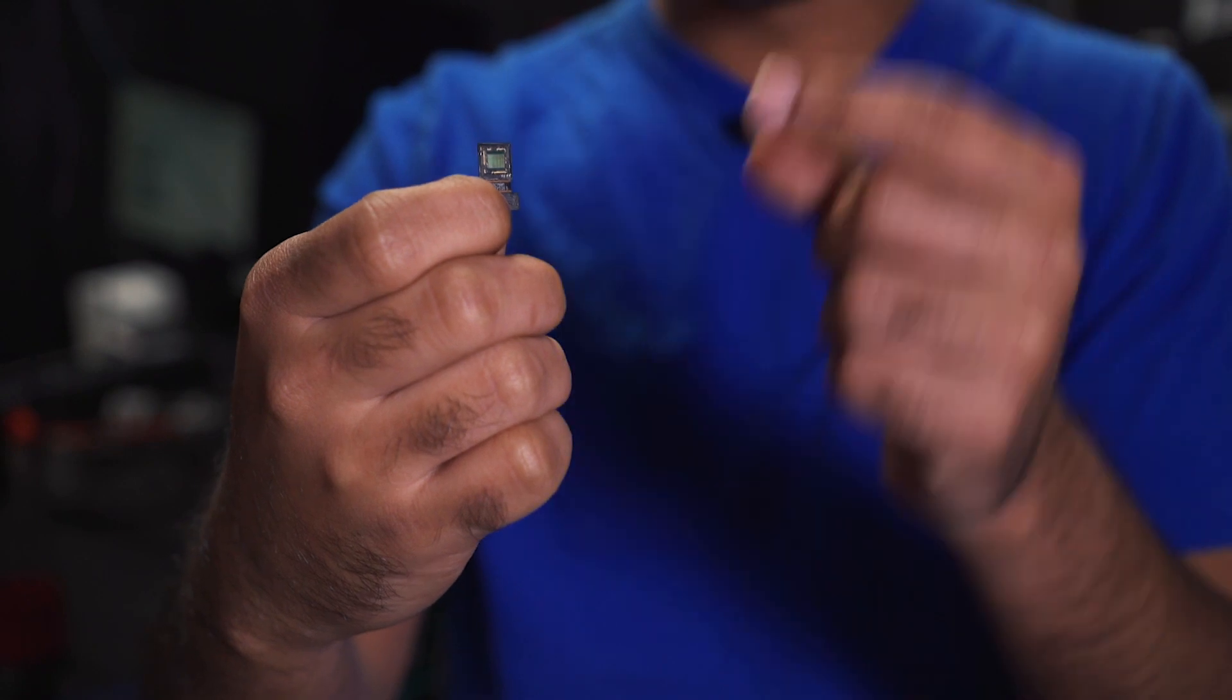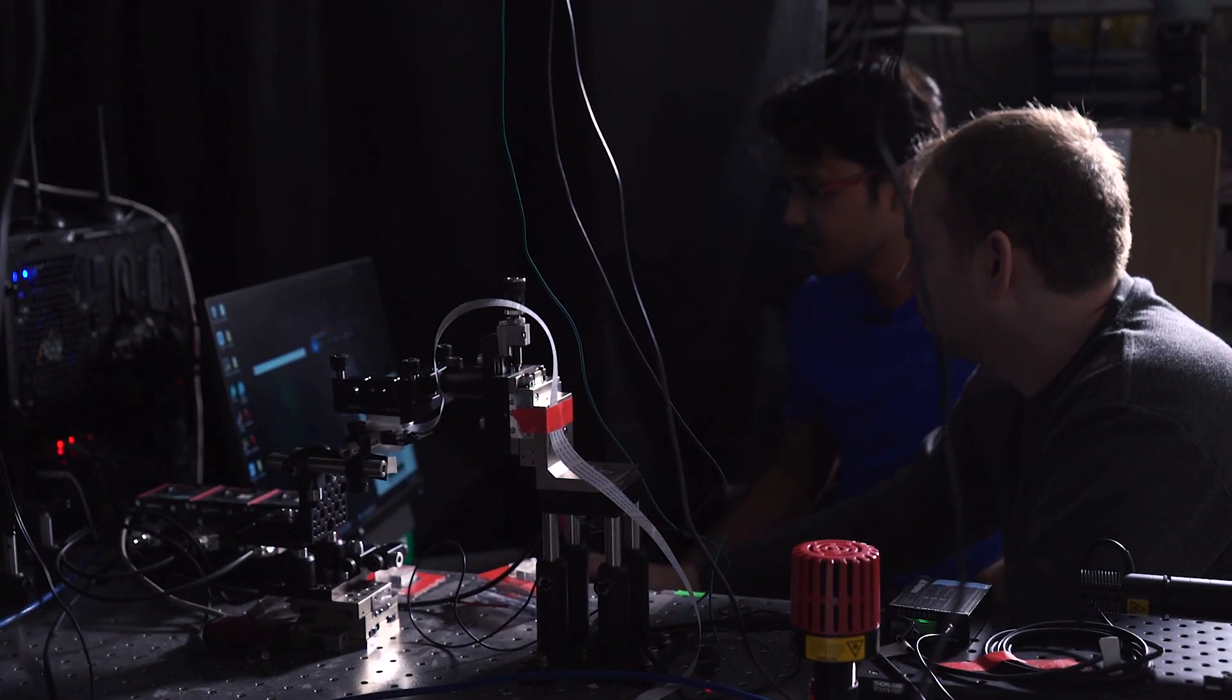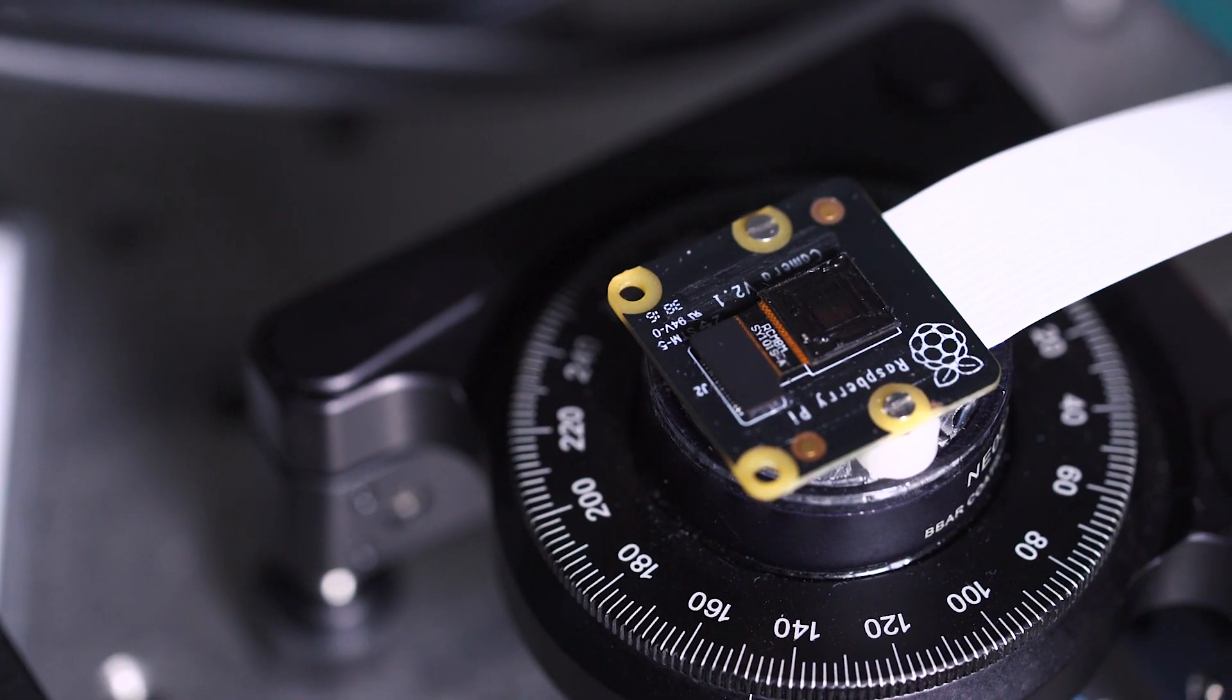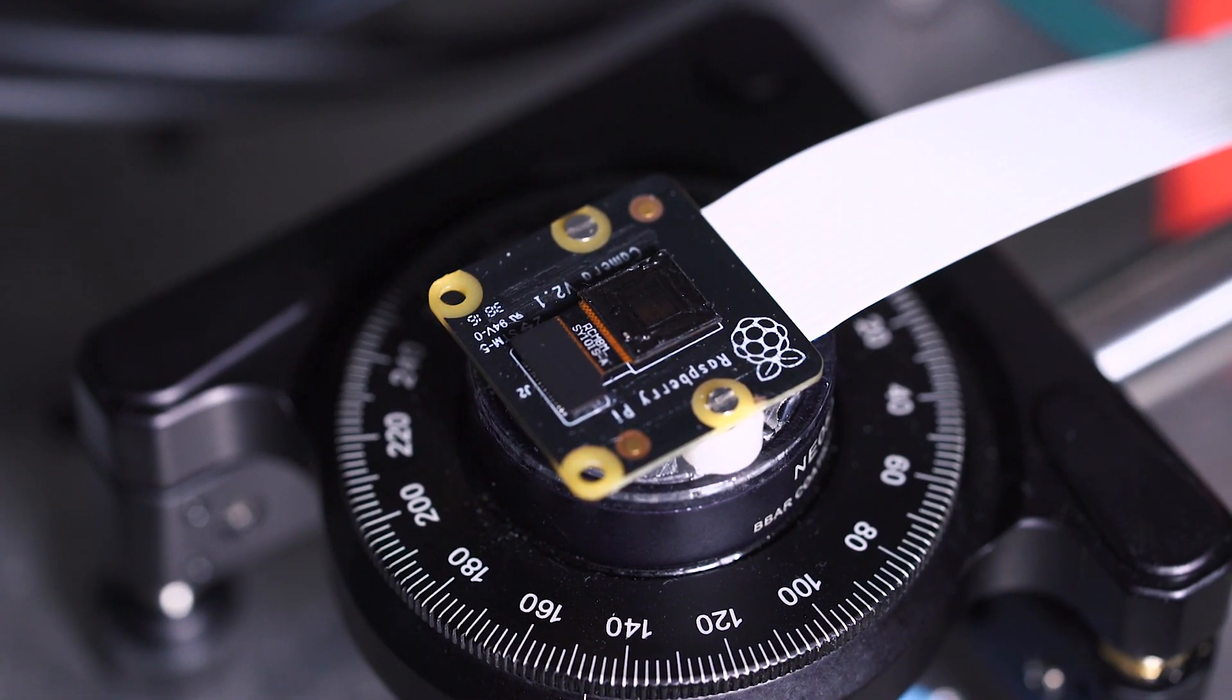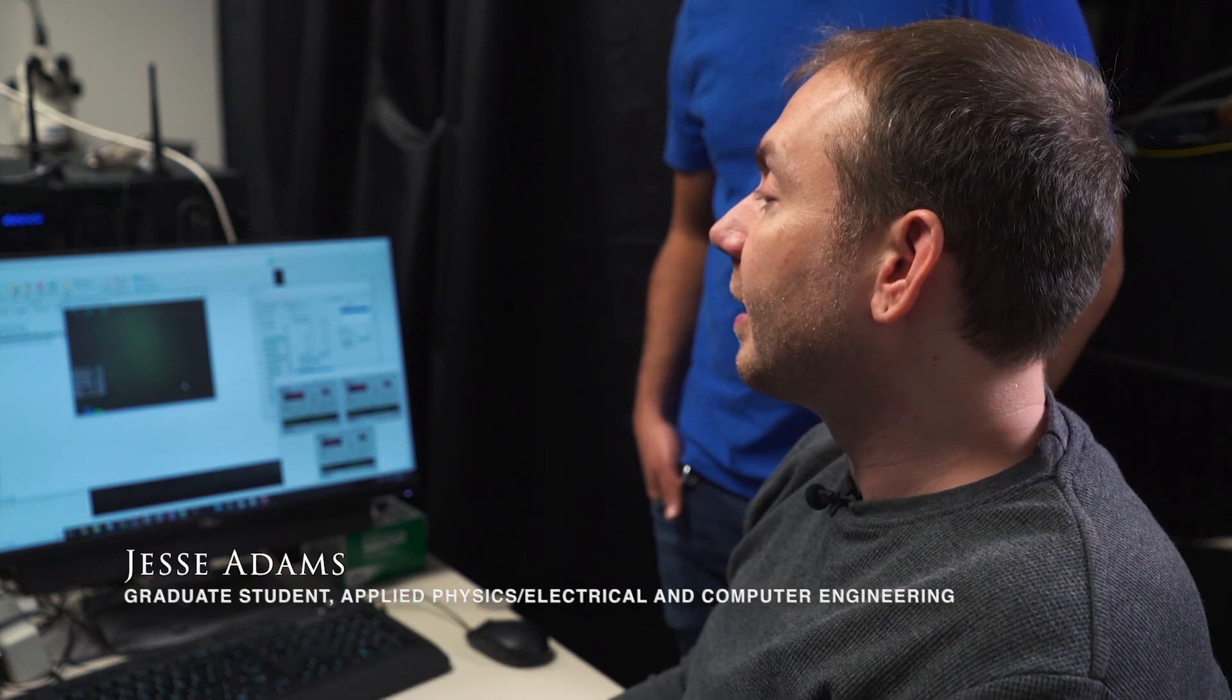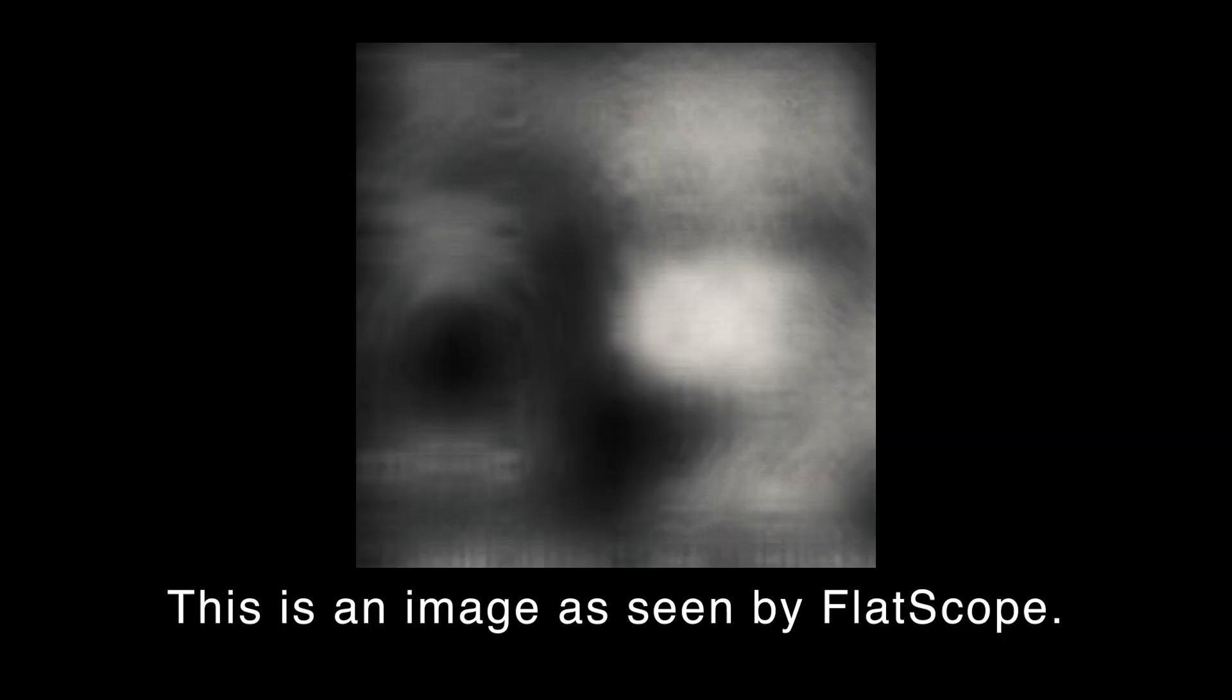By removing the lens, we can make it this small, but we have to compensate for the lens somehow. So we're removing the lens completely from the system and replacing it with an amplitude mask, which basically blocks some of the light and allows some of the light to come through directly to the sensor. What we see is some combination of those open and closed areas landing on the sensor, and we use that to reconstruct the image.